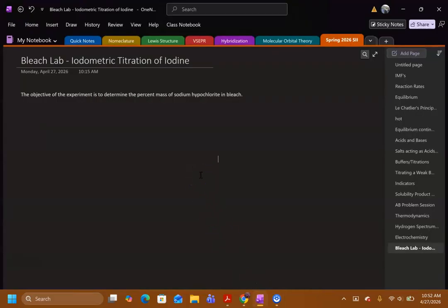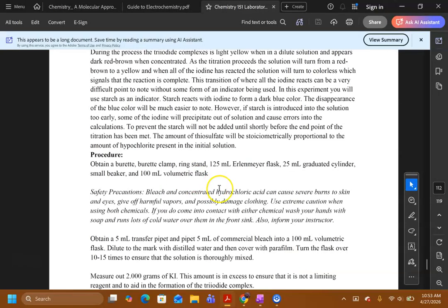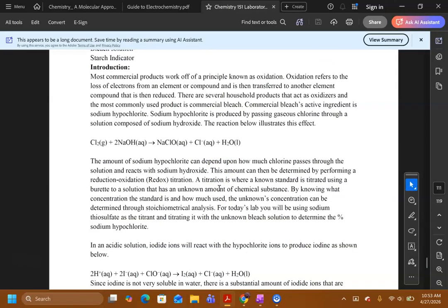So this video is pertaining to the Bleach lab, which is what we're going to be doing this week. And the Bleach lab is where we're going to determine the percent of sodium hypochlorite in commercial bleach. And so we're going to do this through a means called redox titration. And so what we're going to do is go look at the lab manual for a couple minutes here. So in the lab, we need to understand basically what's happening in the reaction.